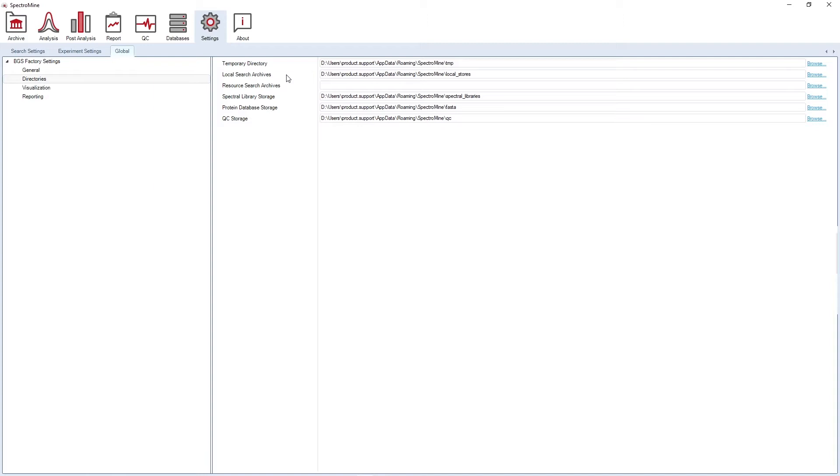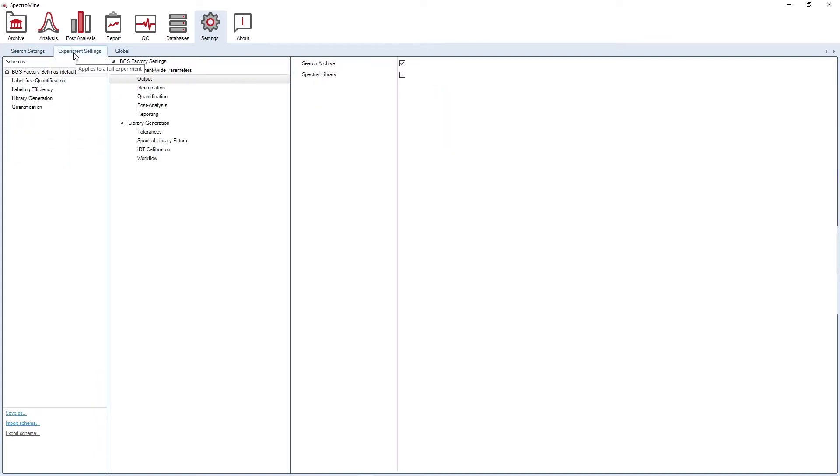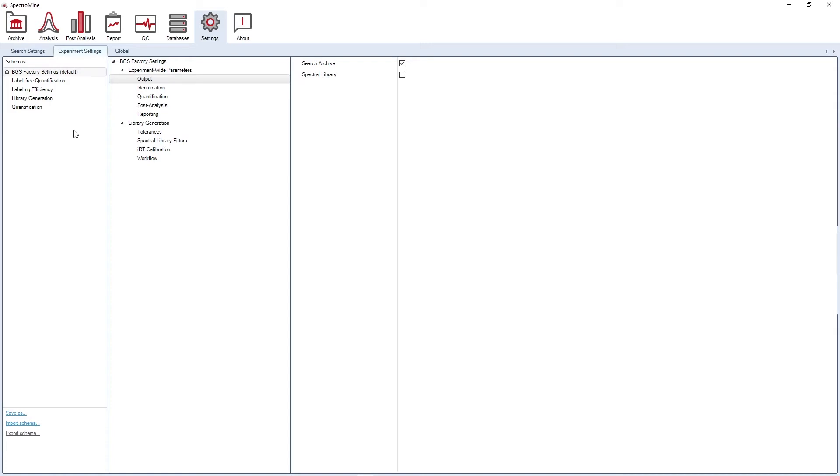Under settings, you can also find the parameters for your analysis such as the search settings that are helpful for the peptide search, as well as the experiment settings, which are pre-made depending on the workflow that you would like to perform. Here, you can also create your own setting schemas. And it is important to notice that the settings are also displayed when you perform an analysis and can be modified there.